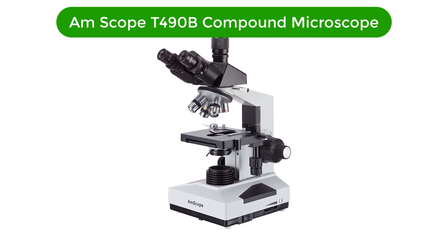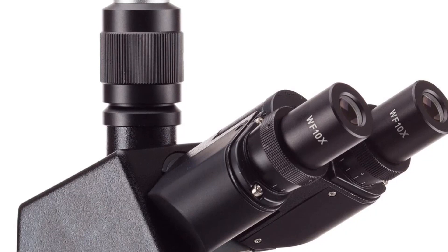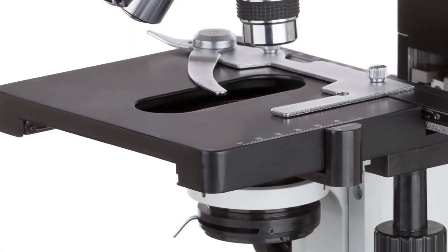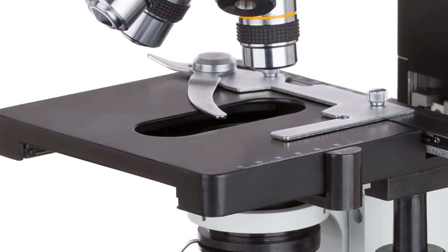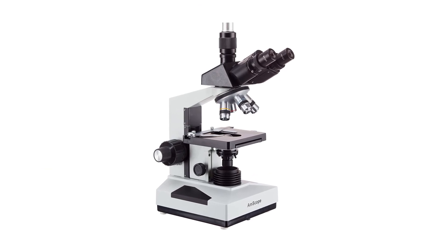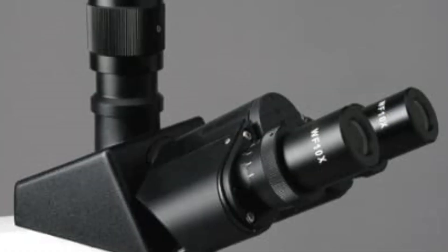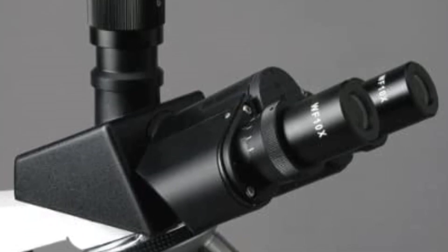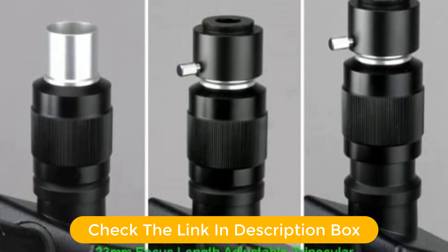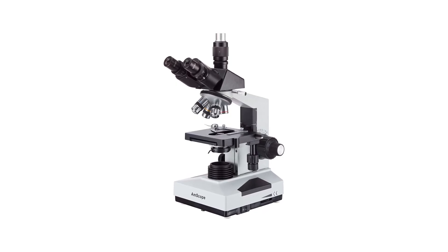Number three, our third best pick is the AmScope T490B Compound Trinocular Microscope — the perfect choice for those who demand the highest quality optics and performance. This microscope features a 40x to 2000x magnification range, a halogen light and Abbe condenser, a two-layer mechanical stage, and high-resolution optics. The halogen light provides bright, crisp illumination, while the high-resolution optics deliver crystal clear images, making it ideal for applications from medical research to educational purposes.